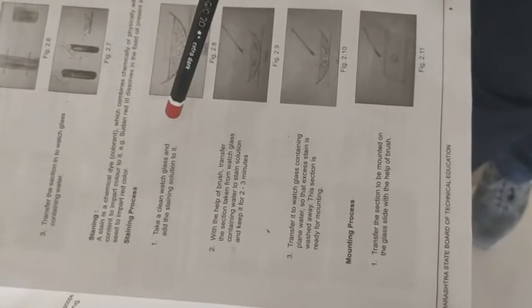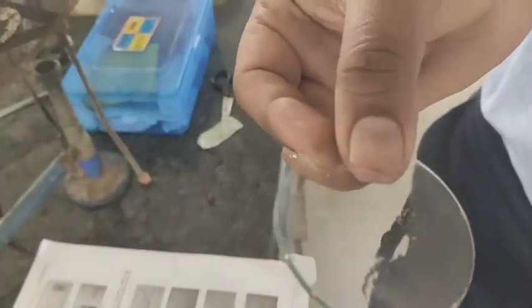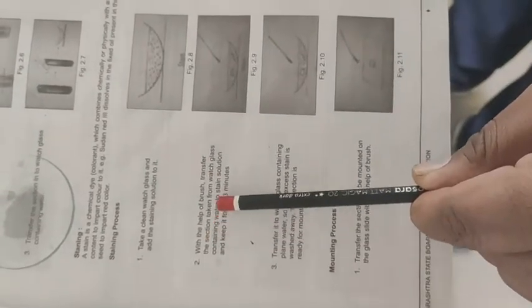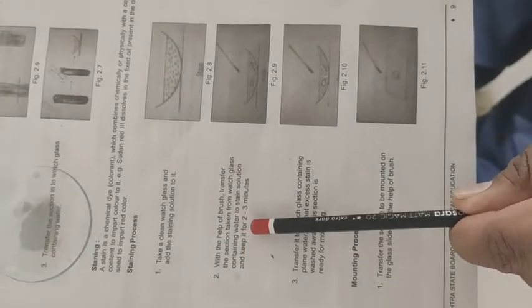In this staining procedure, how can you do it? Take a clean watch glass and add staining solution to it. After that, with the help of a brush, transfer the section from the watch glass containing water to the stain solution and keep it for 2 to 3 minutes.